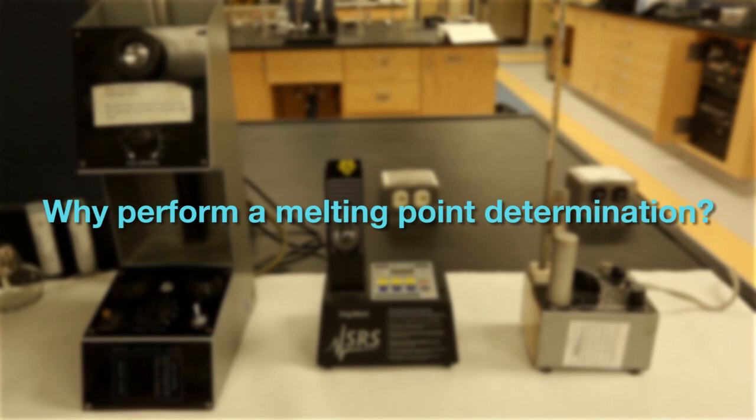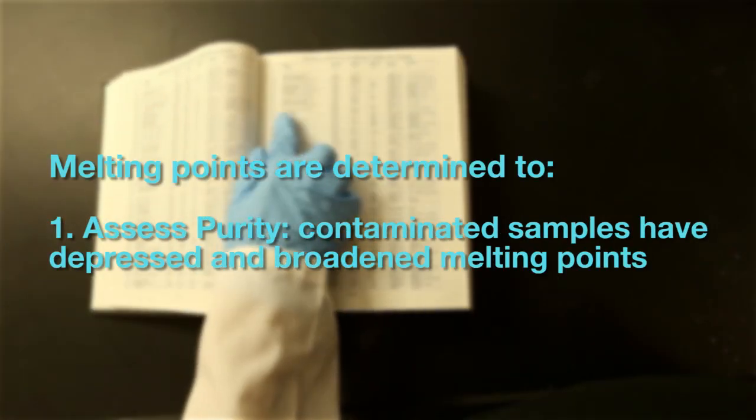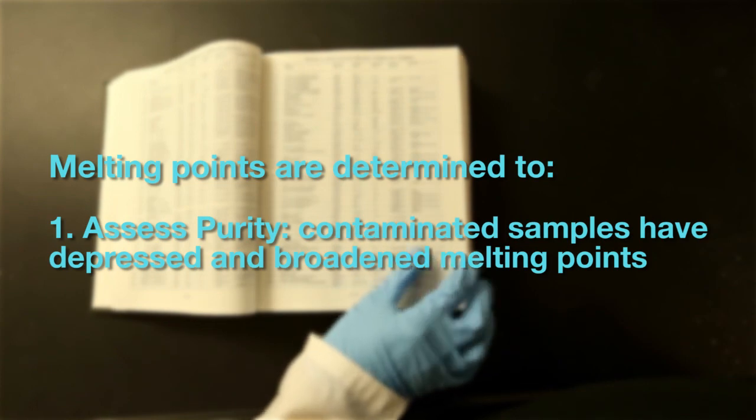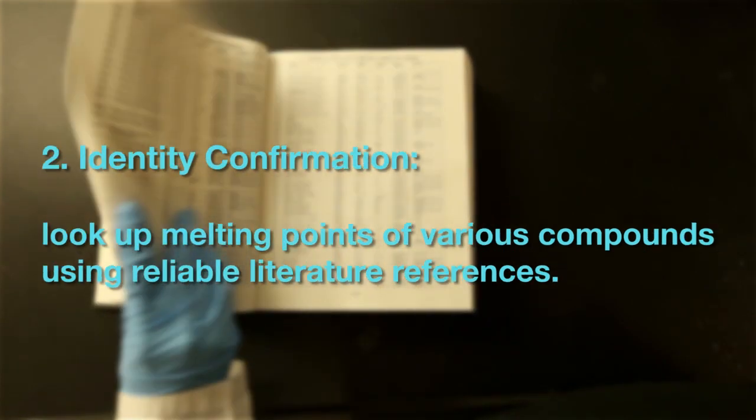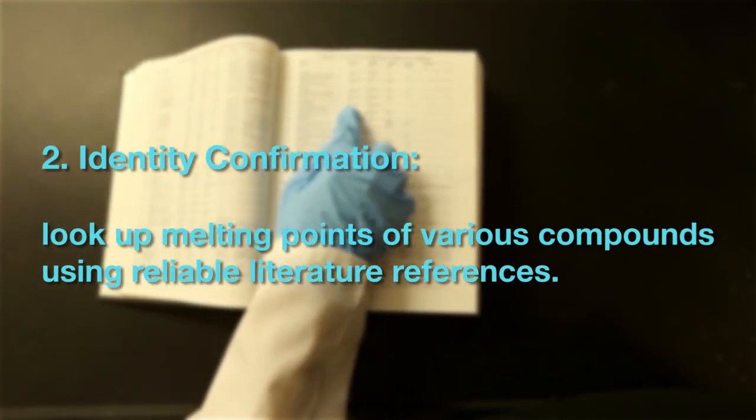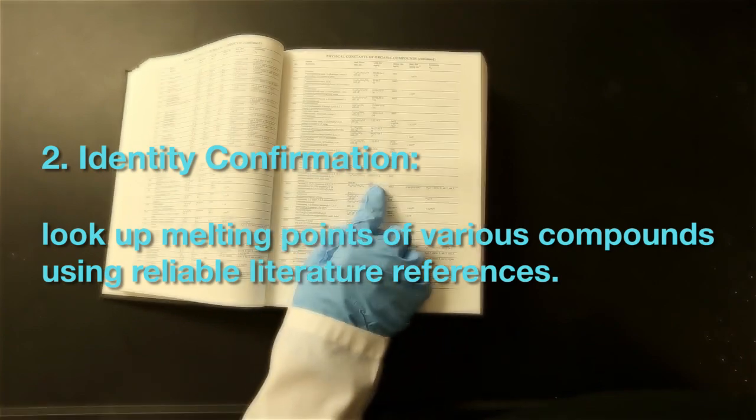There are two main reasons as to why a melting point analysis should be performed. Firstly, it can aid in the determination of the compound's purity. Secondly, it enables you to determine the compound's physical property to compare with the literature values.